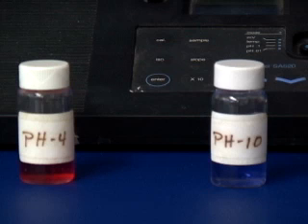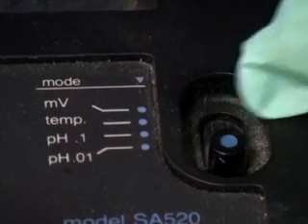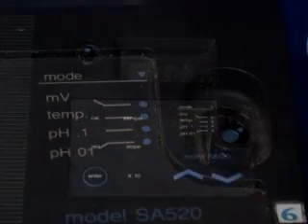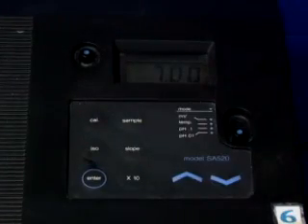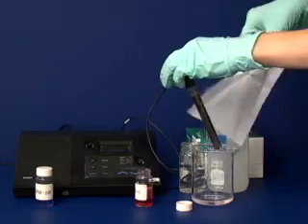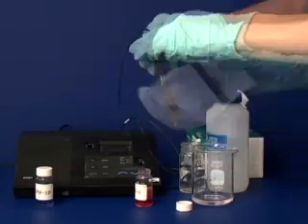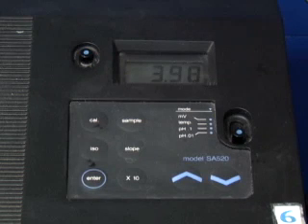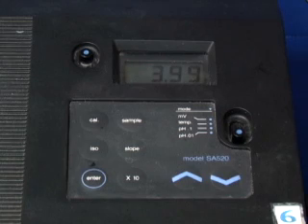We will perform a two-point calibration. This method involves calibrating the pH meter with two different buffers of known pH. Turn on the instrument and select the pH mode as 0.1 or 0.01. Then press the ISO button and verify that the pH reads 7.00. Rinse off the probe with distilled water into a waste beaker and gently blot it with a kimwipe. Place the probe into the first buffer and press the cal button. The number 1 should appear on the display. The display will alternate between 1 and the pH value of the solution. Wait until the display stabilizes and press enter.